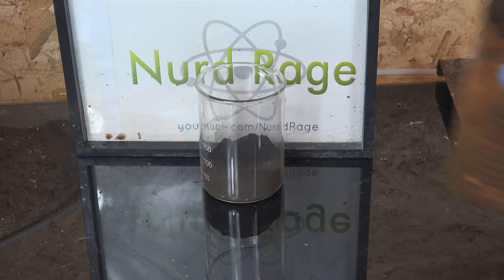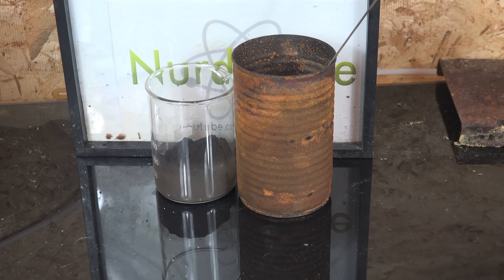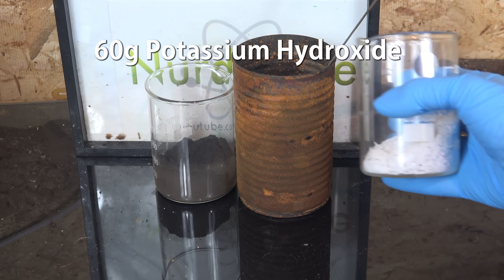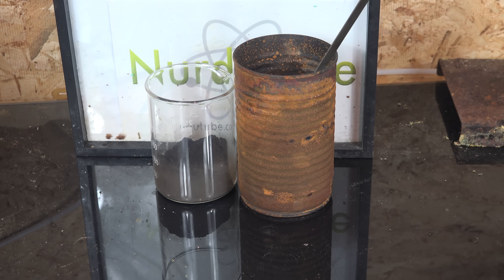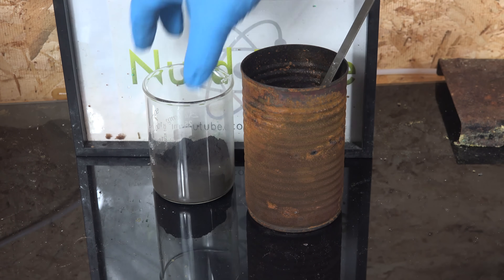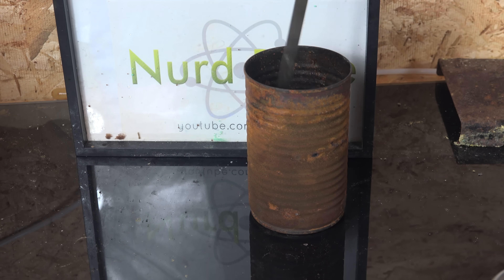Now we get an iron can to use as our crucible for the reaction. We can't use glass, as it will dissolve in the potassium hydroxide. To the can we add 40mL of water, then dissolve in 60g of potassium hydroxide — the water is optional, added only so the potassium hydroxide is evenly distributed and won't clump up. We then mix in the manganese dioxide and potassium chlorate from earlier and thoroughly stir to combine the reagents.